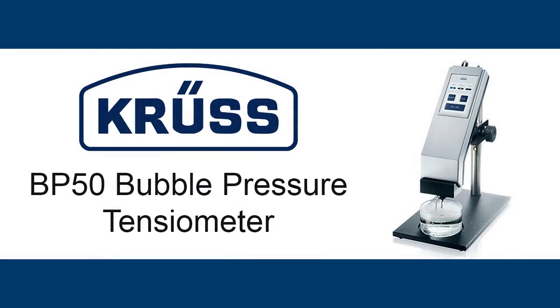The second method of measurement is automated using the BP50 bubble pressure tensiometer.